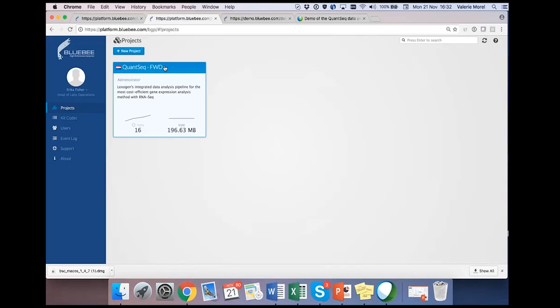Julianne is asking, 3' sequencing being different from classical whole mRNA sequencing, do you use a special gene annotation for 3' sequencing? As I said, for the Ensembl annotation, it works fine. We had customers, I think it's also on our webpage, our first webinar, where they sequenced chicken, and there they needed to extend the existing annotation.